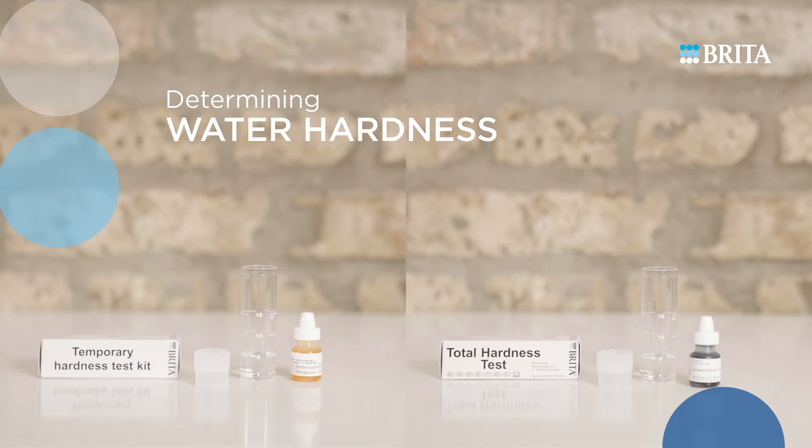Determining Water Hardness. Use the appropriate Brita test kit to measure the temporary or total hardness of the local tap water. This is necessary in order to identify the recommended bypass setting for a Brita filter system.